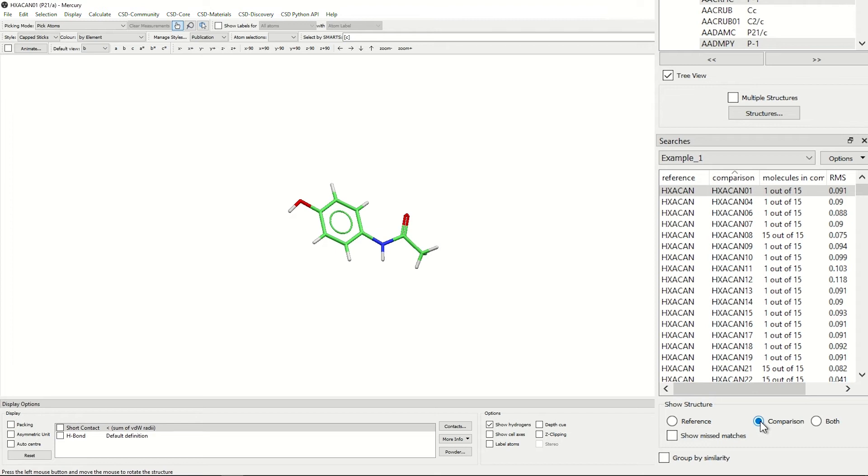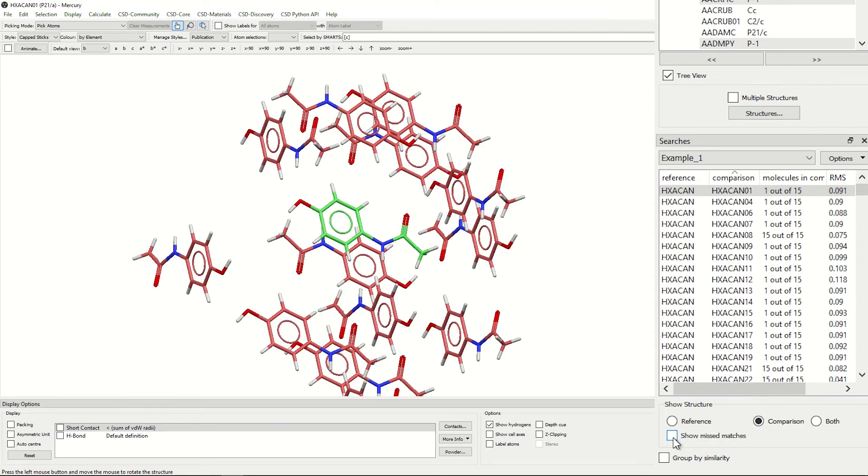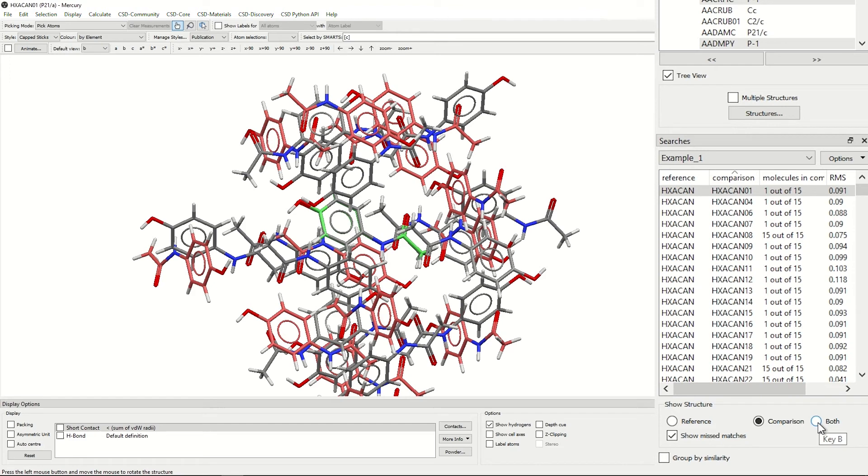However, if you click show mismatches, it will show you all of the molecules that were not successfully able to overlay in pink. If again, you click on both, you're able to see the reference structure in all the default colors, the comparison structures that were able to overlay in green, and the comparison structures that were not able to overlay in pink.